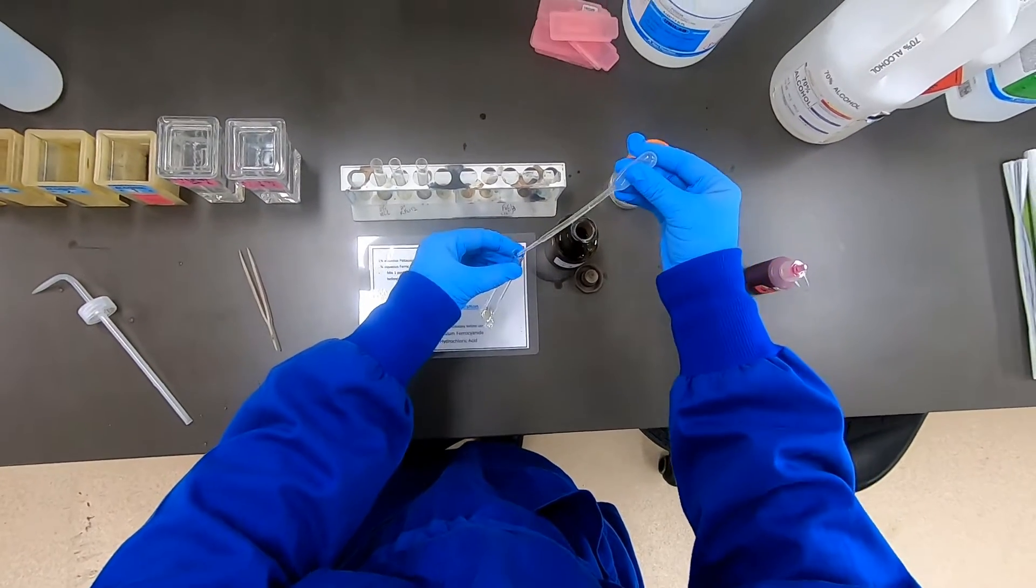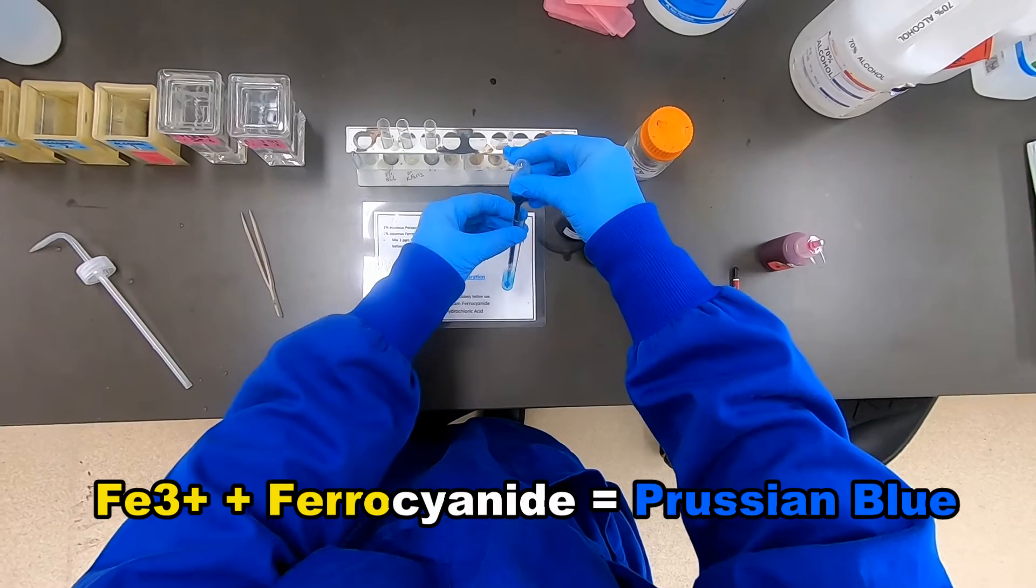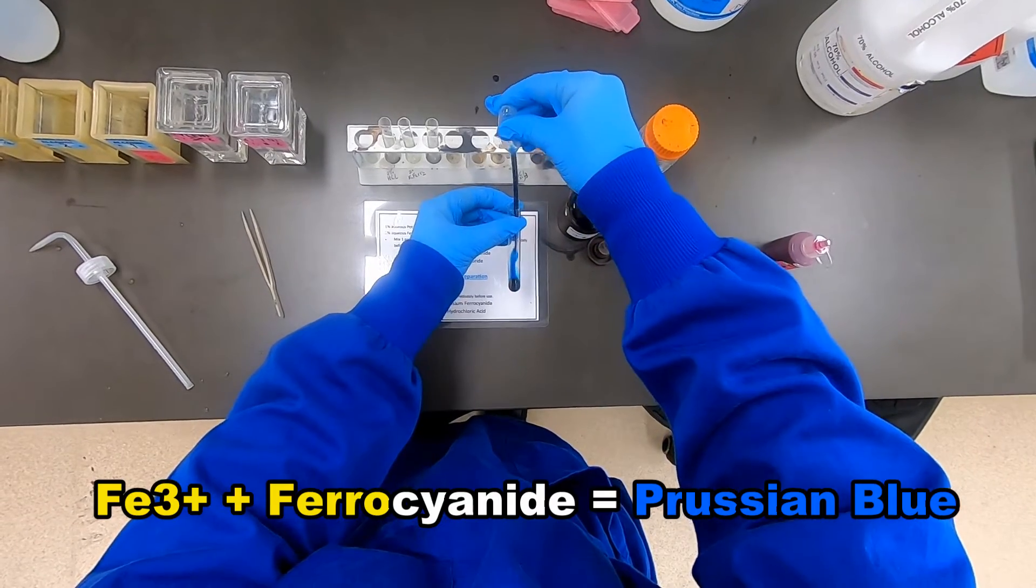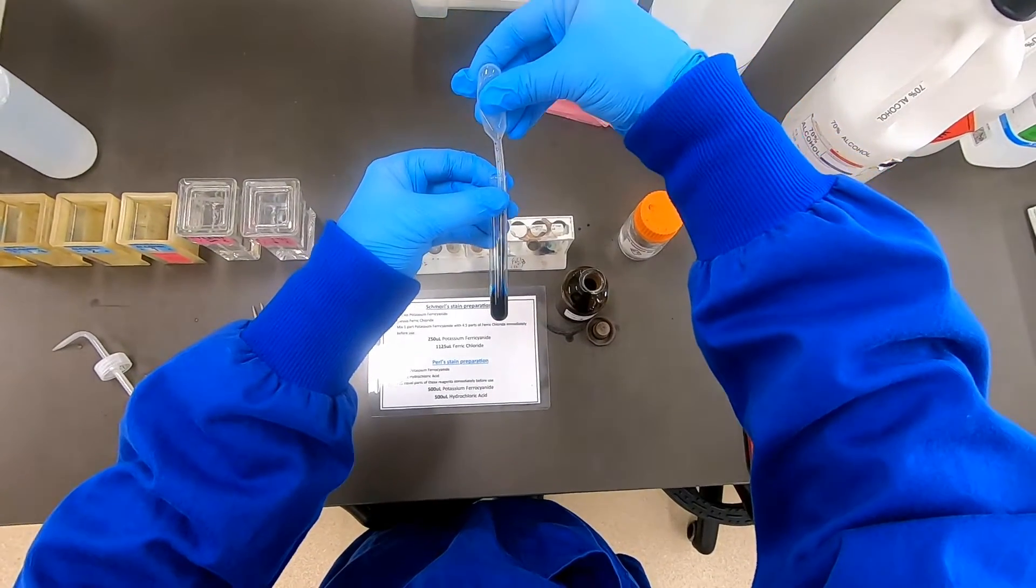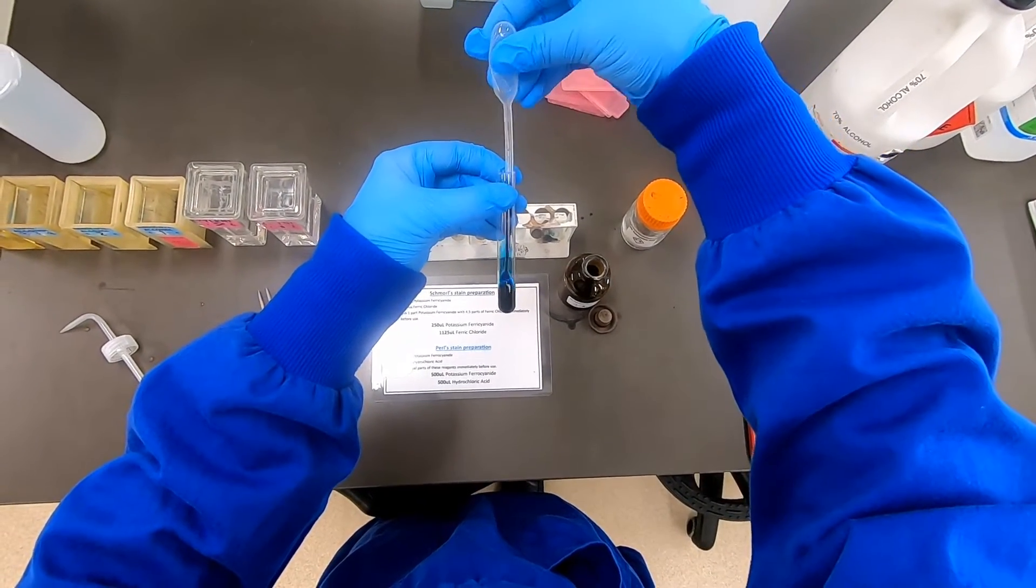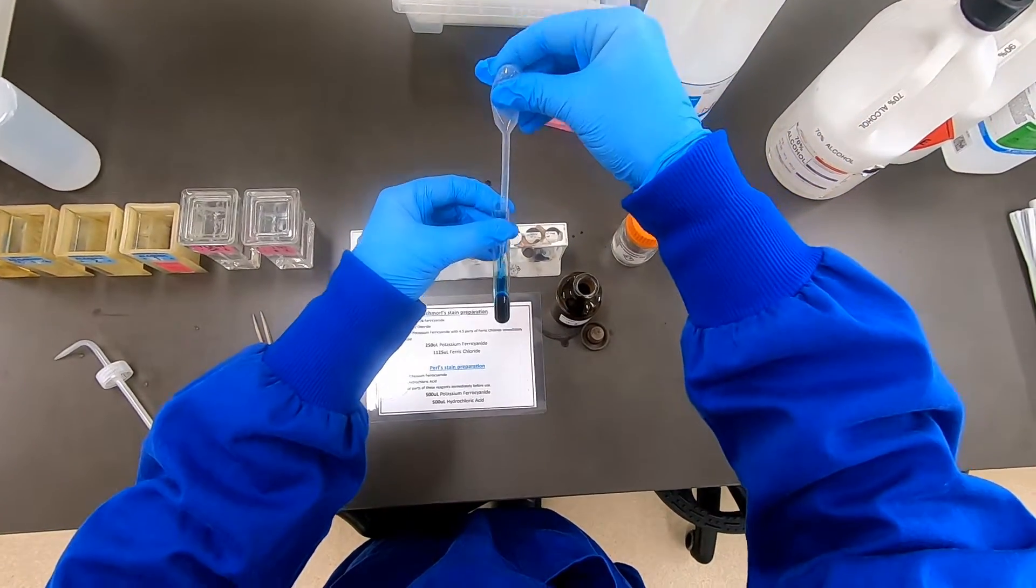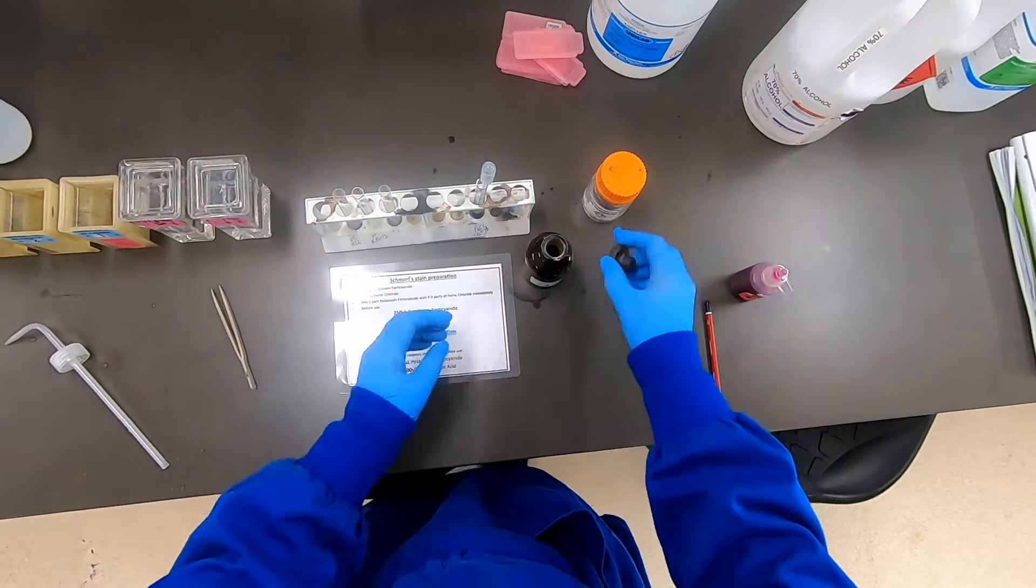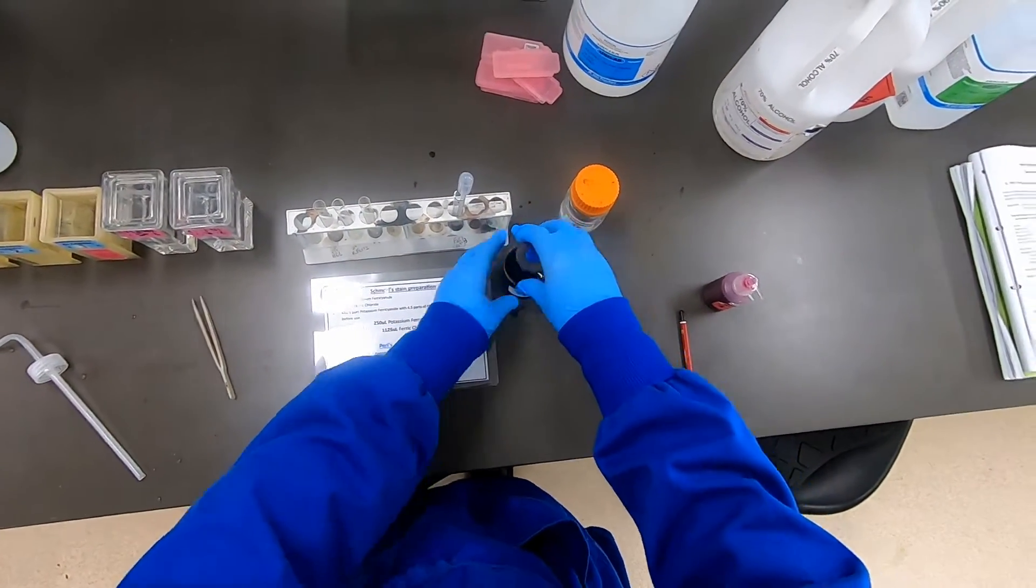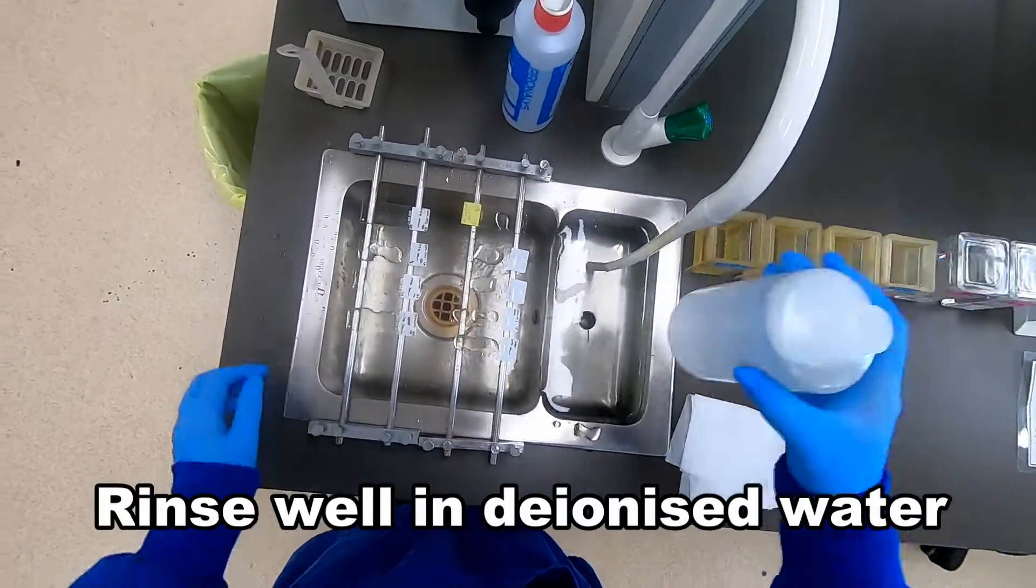See there it's quite yellow ferric chloride. But when we add the potassium ferrocyanide, we effectively produce that ferric ferrocyanide or Pearl's prussian blue. That's the color change we should see on the slide wherever there are Fe3+ ions, which are incorporated into the tissue in structures like hemosiderin.